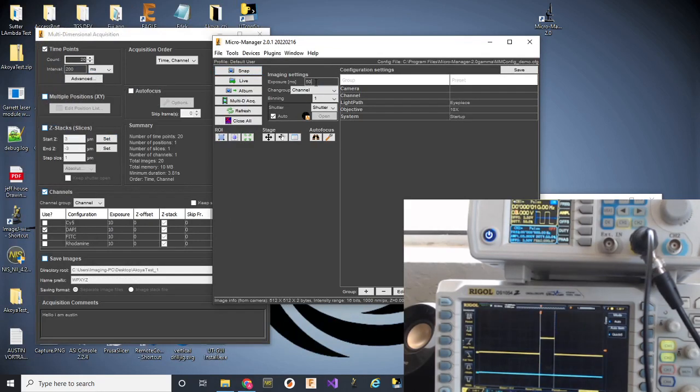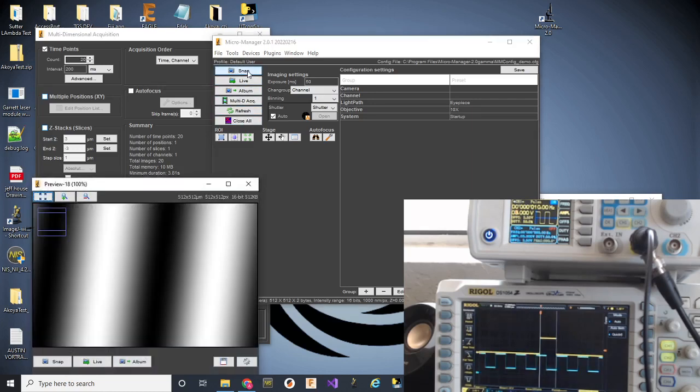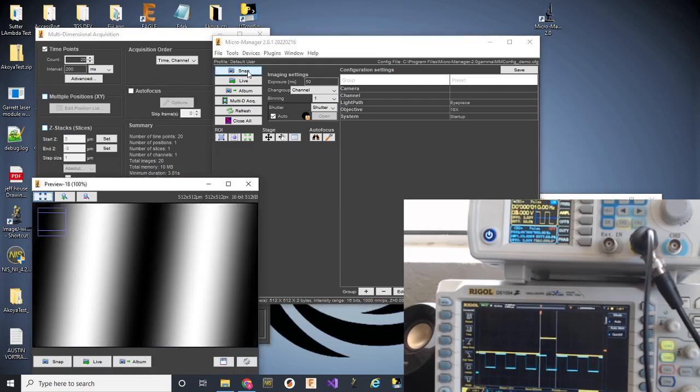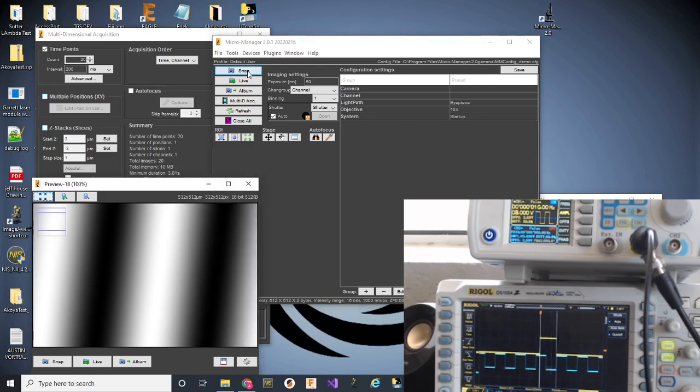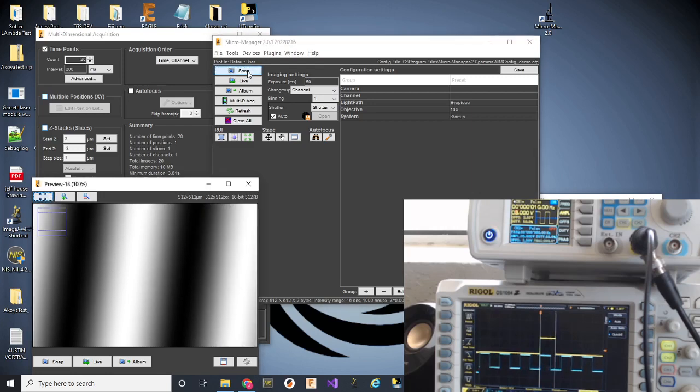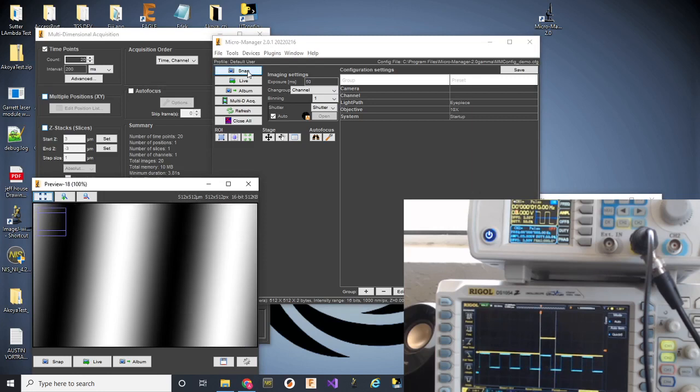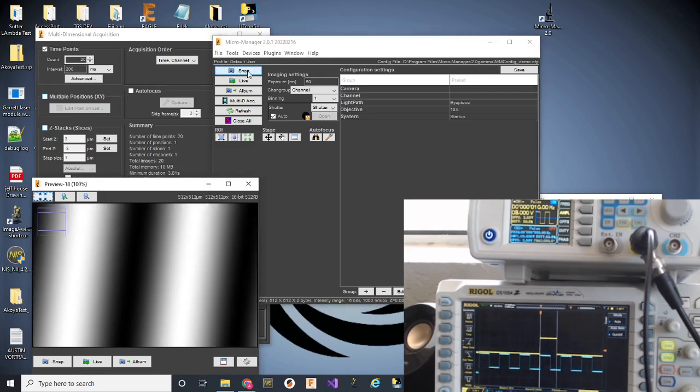The frequency of the signal is currently set at 100 milliseconds. So, it's a half duty cycle. It's going to go on for 50 milliseconds and then back off for 50 milliseconds. If I snap an image, it just depends on where we catch the signal generator. We caught it in this case. Actually, it doesn't even matter. We're not catching the signal generator because blanking is not turned on. So, the blue line is showing up, but the camera is just doing its thing. Or I should say TTL1 is doing its thing. It's not in any way correlated to the blue line.